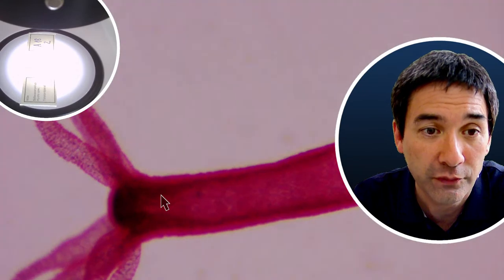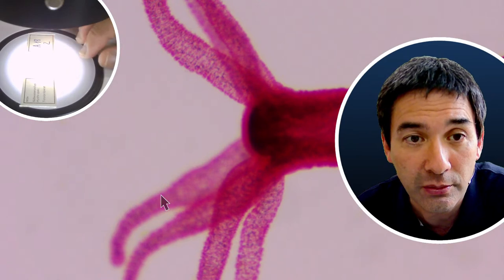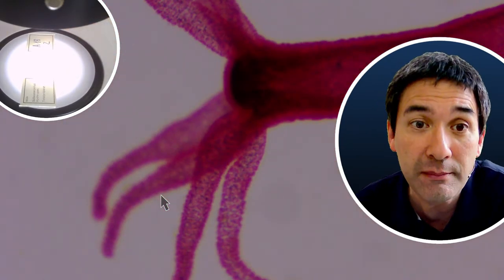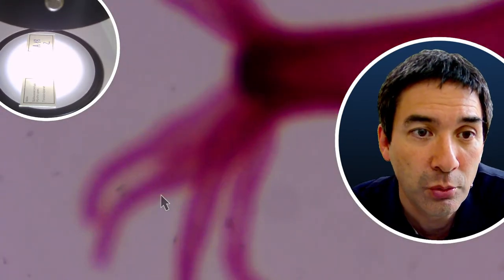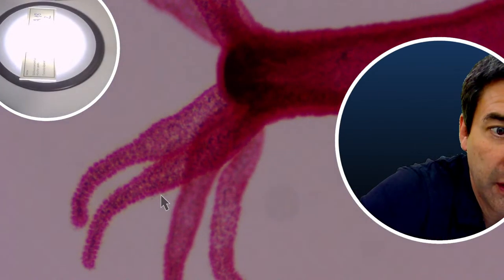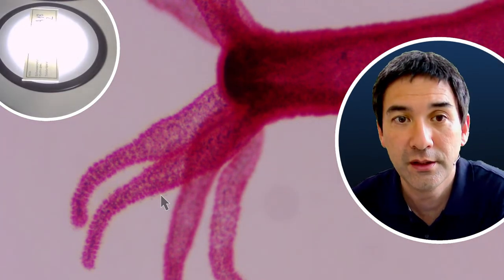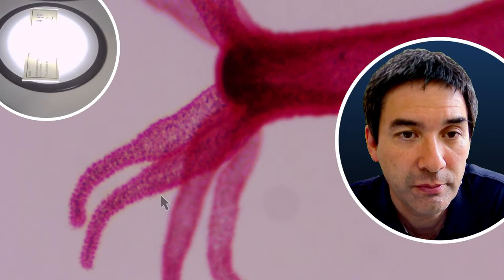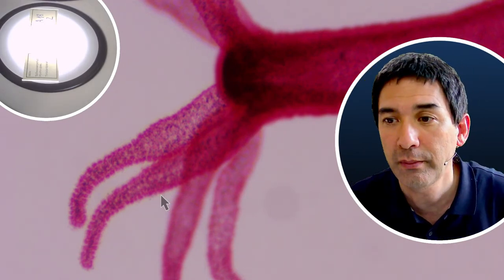That is Hydra now. One of the more difficult things about a stereo microscope is that it doesn't generally need a mechanical stage, but that of course makes it a little more difficult to move the slides around with more patience needed. This is Hydra under a stereo microscope. And if we want to look at this Hydra using a compound microscope, I'll switch over again.